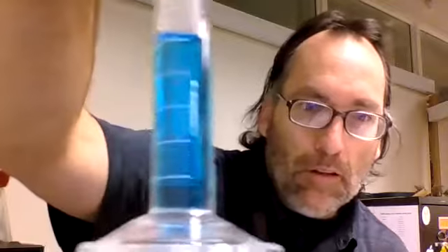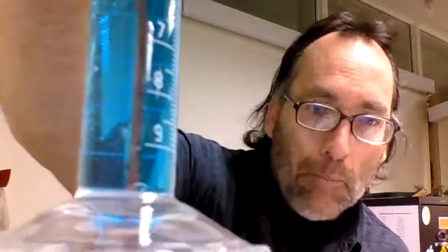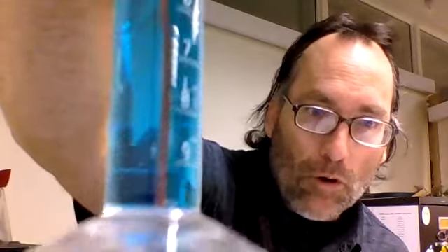All right, let's go ahead and take a look at minute 2. Let me bring it up here close, so hopefully you can see. Again, something that I'm seeing, especially towards the bottom, is a little bit of bubbling. Some bubbles are beginning to form, especially towards the bottom area. And I will say, I know it might be hard for you to see, we definitely have a stronger color change in the paper clip. So that's at the 2 minute mark.